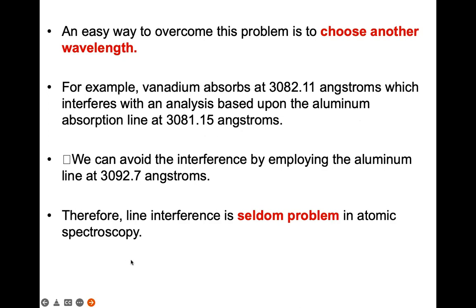Usually the new versions of instruments don't have this issue because now it is a good system. A lot of study has been done, so they already know the specific wavelength for certain elements that doesn't overlap with other elements.